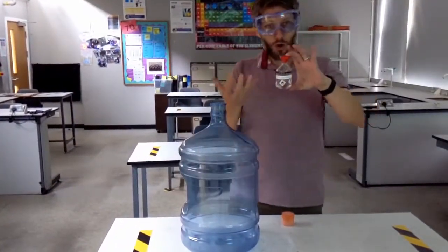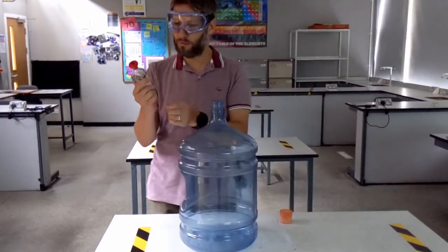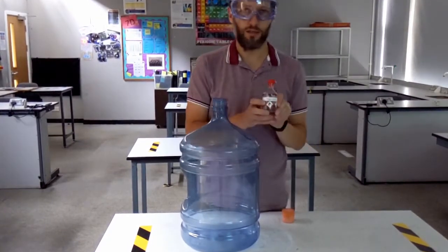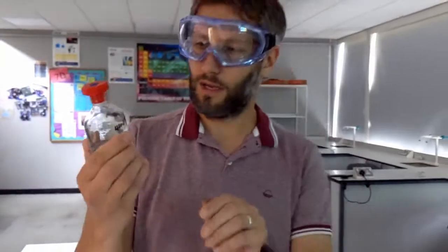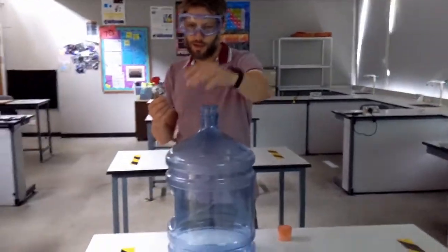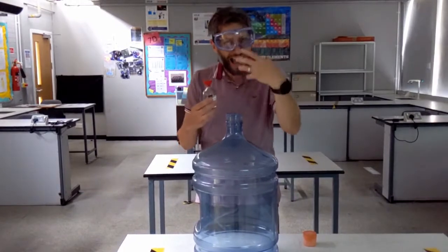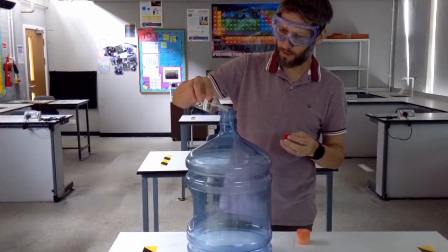So this is an alcohol. You'll have heard that word alcohol. Alcohols tend to be fuels. We've got flammable symbols on it because it is a very flammable fuel. Okay, so we're going to put some in here. We're going to let it vaporize for a few seconds so we get some gas of it produced, and then we're going to see what happens. So I'm going to just tip that in.